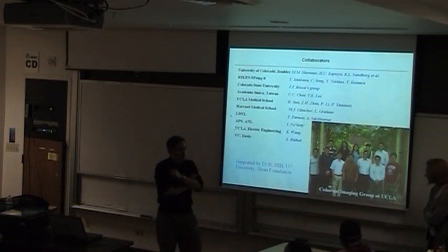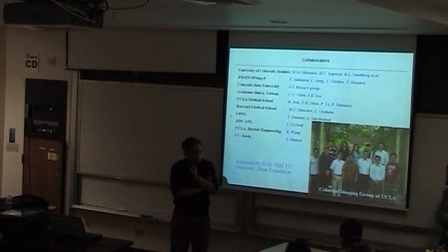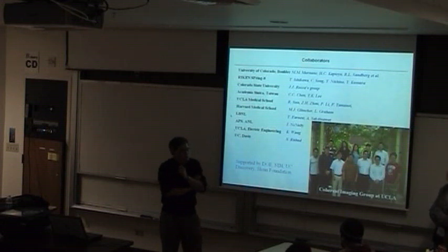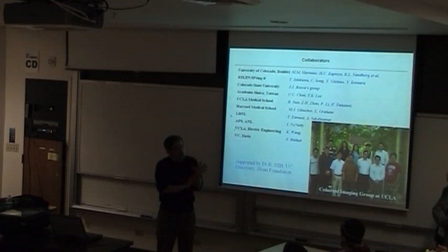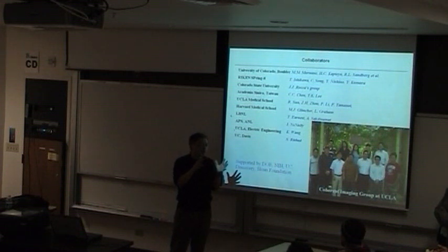Kind of a continuation question. So what factor of oversampling are you talking about? When you say oversampling, I assume you mean you're sampling above the Nyquist rate, but what factor? Well, typically in our case, we use oversampling a little larger than 2 in each dimension. For experiment, because it's a trade-off.